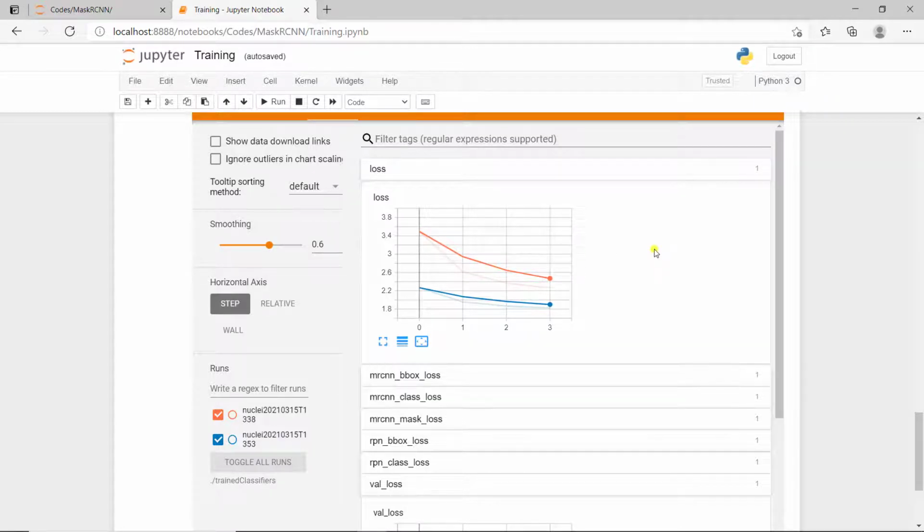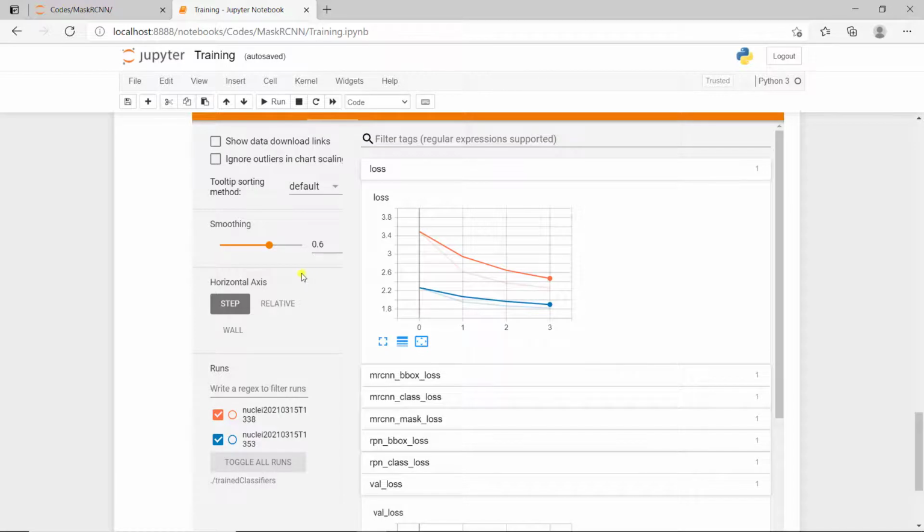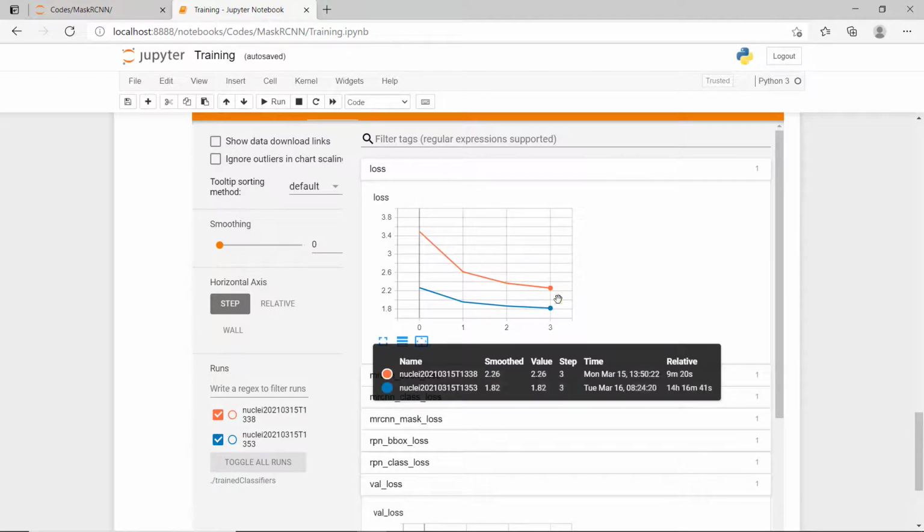For UNet, it made sense because we had many curves, and convergence was not super smooth. So if you don't use the smoothing, it's harder to look at your curves. Here we just have 4 epochs, so that's not useful. So I'm going to put it to 0. And we now have the actual numbers.